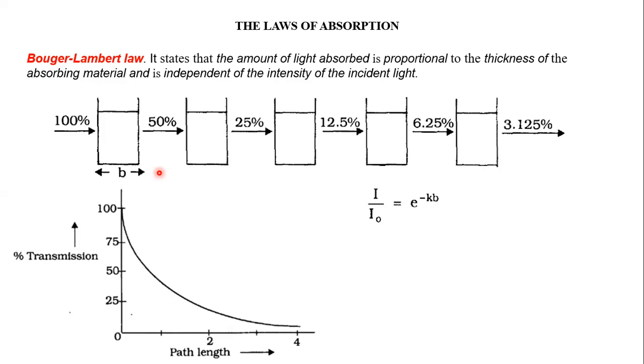So what exactly is happening is this, right? When you are increasing the thickness of the absorbing material, the gelatin sheet here stands as an absorbing material. Now, before going any further, let me give you a perspective of absorption. When anything appears to you in a peculiar color, like say for example, I have written here Bouguer-Lambert law.